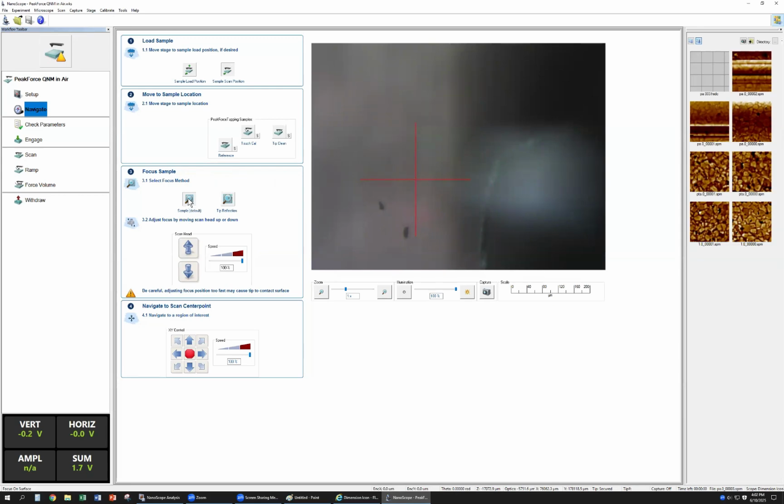So here is the surface, right? If you use the tip reflection, you see the tip's simulated image, so the surface is on the same height. That's only in camera mode. They are not the same. Mode Z is dangerous, but camera mode is not dangerous. Okay, so these are all the clean sapphire surface, so find the clean area.